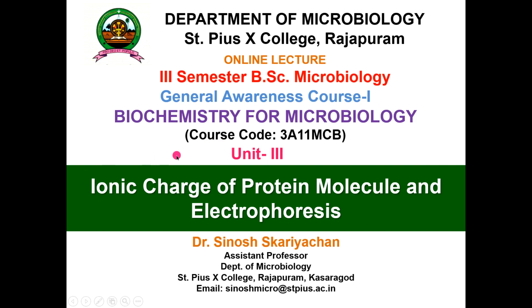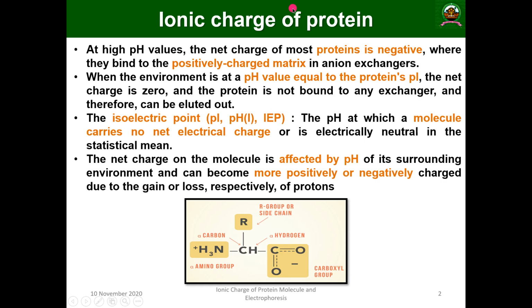First, briefly we will discuss the ionic charges of protein, and then we will discuss electrophoresis. It is a technique to study the molecular weight of unknown proteins. And ionic charge of protein, you have already seen in the previous class.